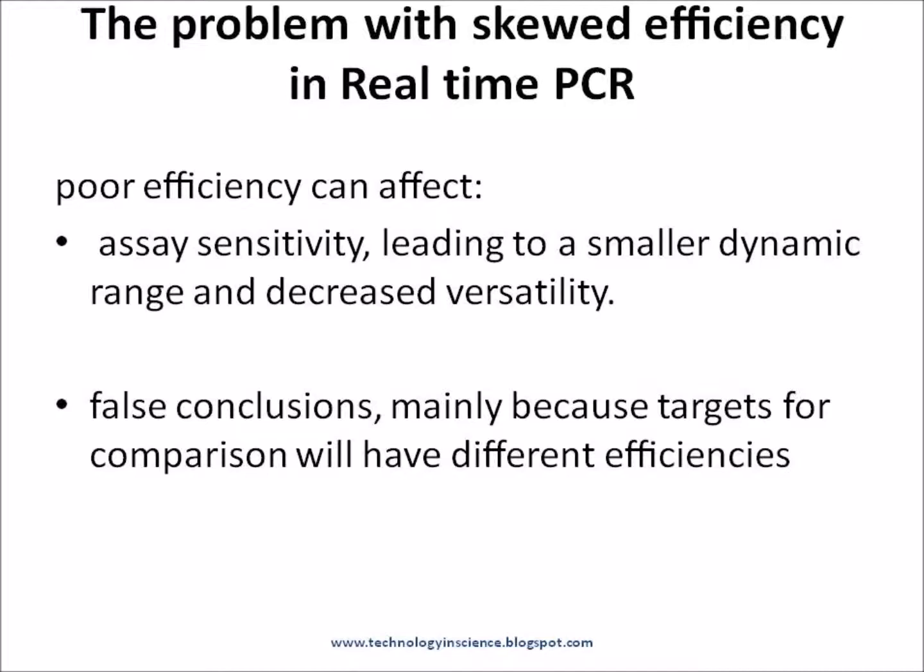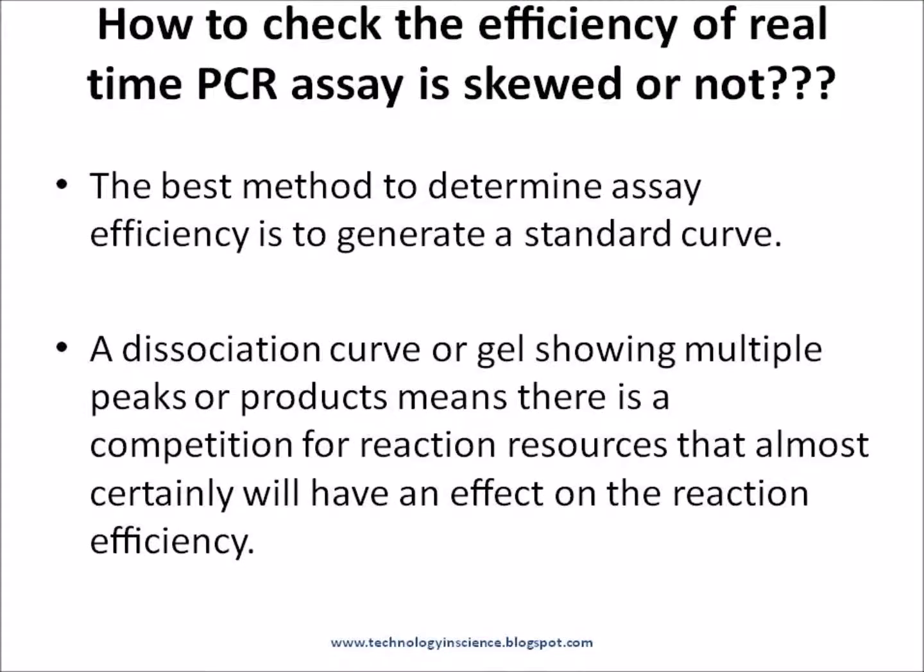Efficiencies outside the range of 90% to 105% may artificially skew results and lead to false conclusions, mainly because targets for comparison will have different efficiencies. In addition, inhibition and poor efficiency can affect assay sensitivity, leading to a smaller dynamic range and decreased versatility.